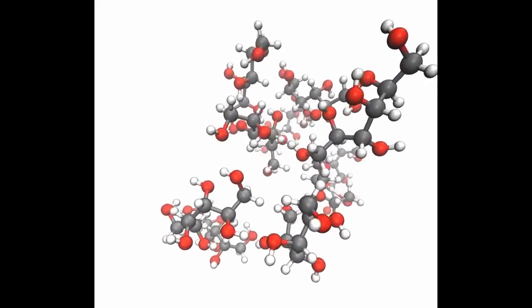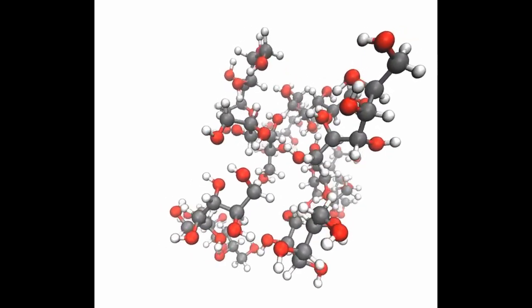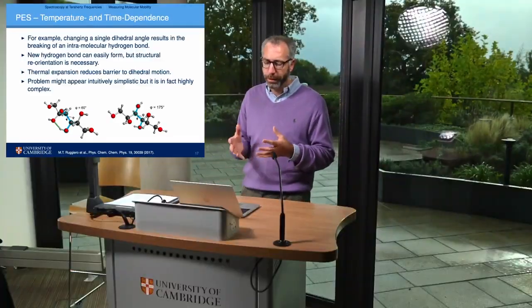However, as the temperature is increased above Tg beta and through Tg alpha, the magnitude of the oscillations increases and fluctuations in the subminima become increasingly prevalent. Now, we can understand the results in terms of that below Tg alpha, structural changes are localized, while temperatures above Tg alpha lead to large-scale conformational rearrangements of the molecules.